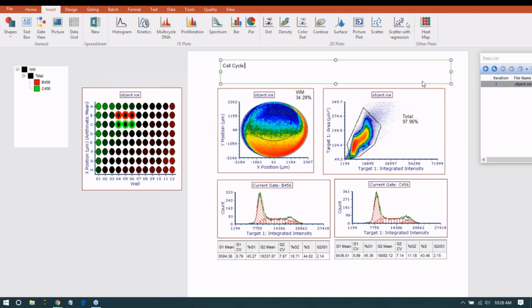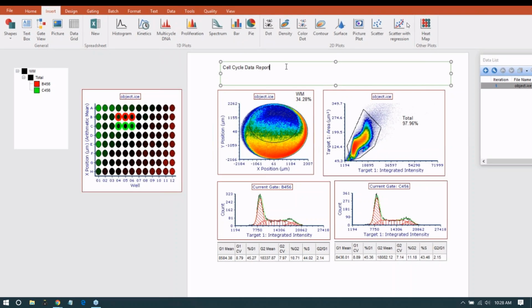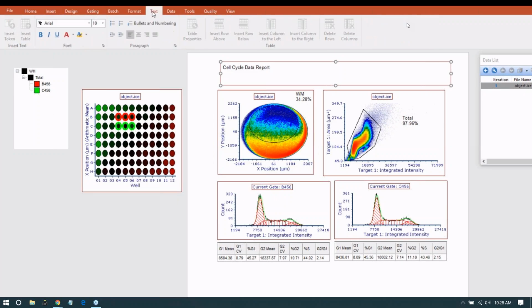This is if you had more specific data that you wanted to put in there, an experiment title. You can do that, or if you want to keep it generic like we're doing here, you can edit the text going into the text ribbon. So we're just making it look nice, so you have the beginnings of a template for your future projects, future experiments on this assay.